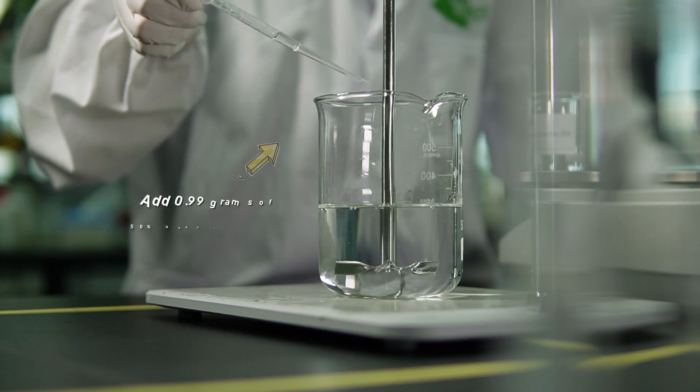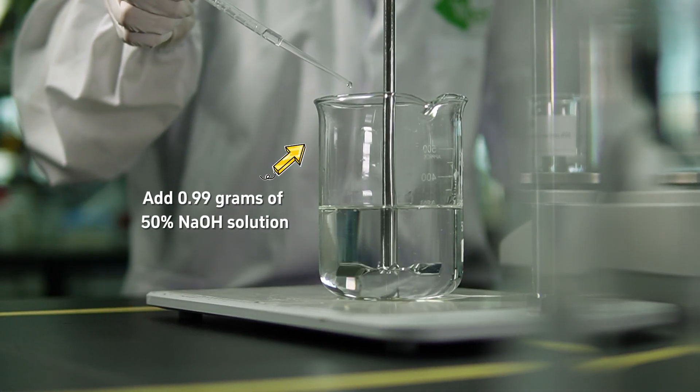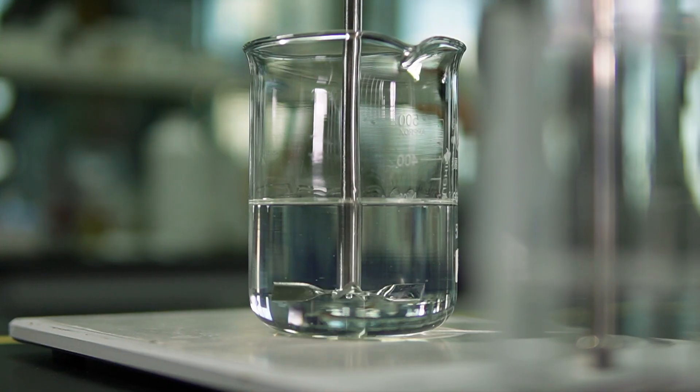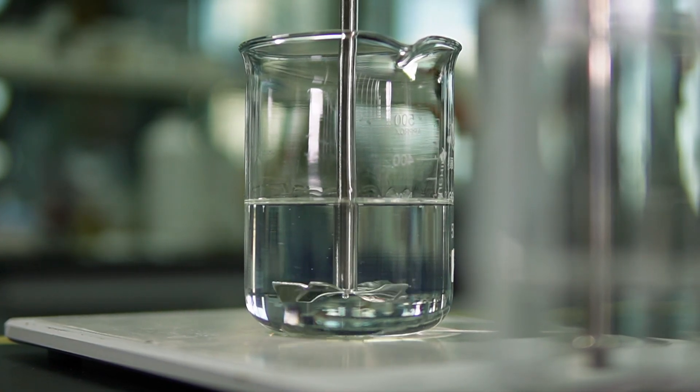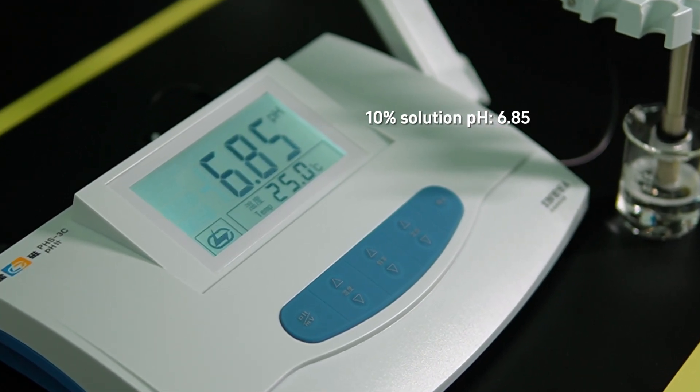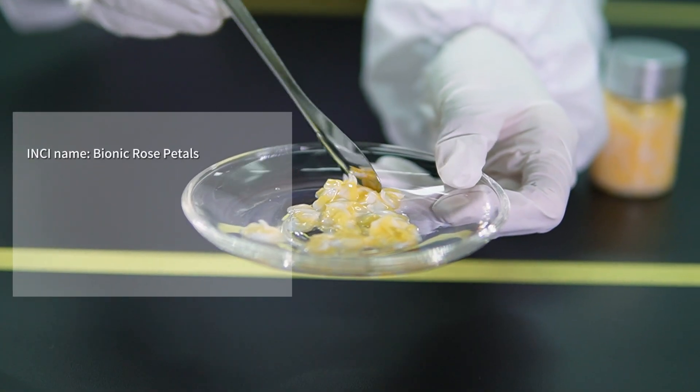We begin by adding just the right amount of 50% sodium hydroxide solution. Our goal? To adjust the pH to a range of 6.5 to 7.0. This ensures that our Rose Petal Reverie Bath Gel not only looks beautiful but is also gentle and kind to your skin. And now, the pièce de résistance, our bionic rose petals.